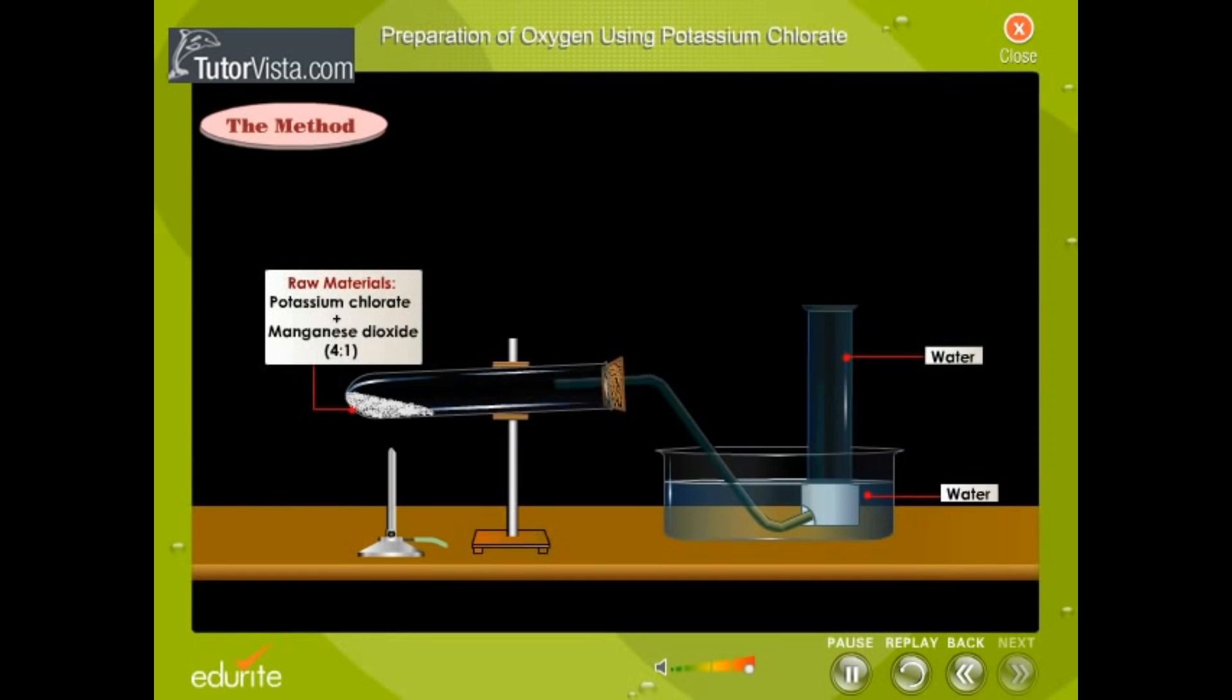Take a mixture of potassium chlorate and manganese dioxide in the ratio of 4 to 1 by weight in a hard glass test tube.